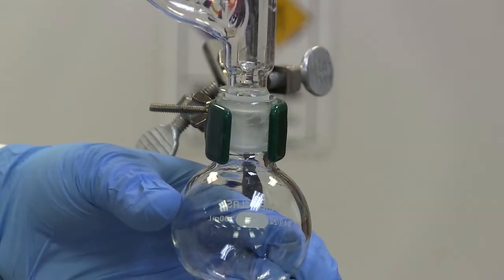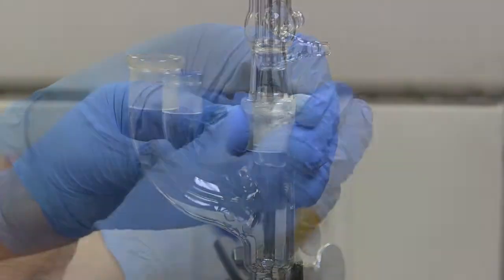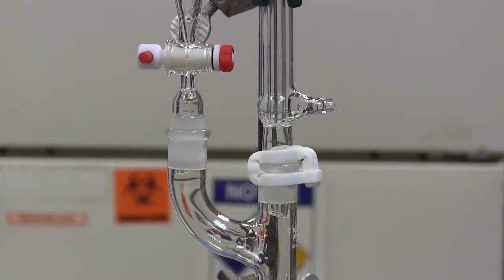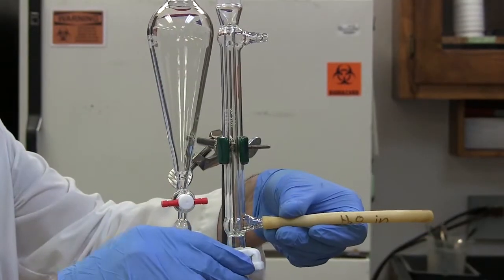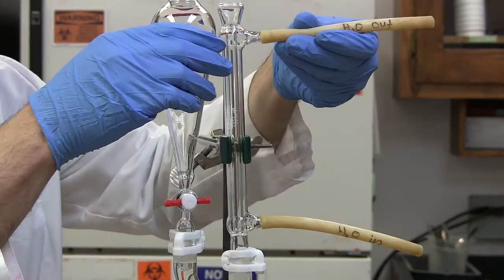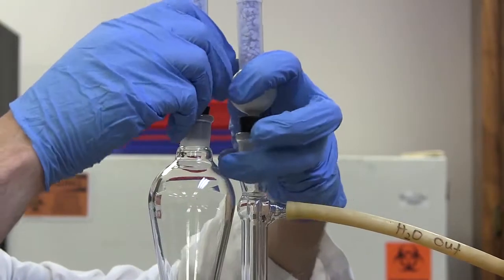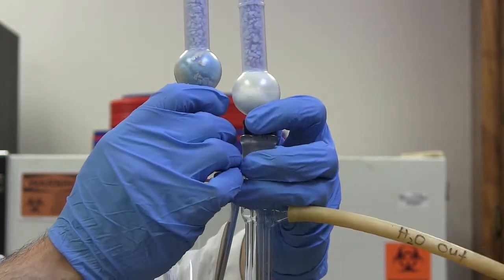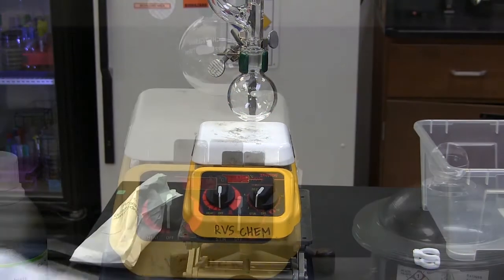Attach a claisen adapter to the round bottom flask. Then attach a condenser to the end of the adapter and secure with a clip. Attach a separatory funnel to the other end and secure with a clip. Connect the yellow hoses to the condenser, in hose to the bottom and out hose to the top, and turn on the water. Attach drying tubes to the top of the condenser and separatory funnel. Finally, raise the jack and turn on the hot plate.